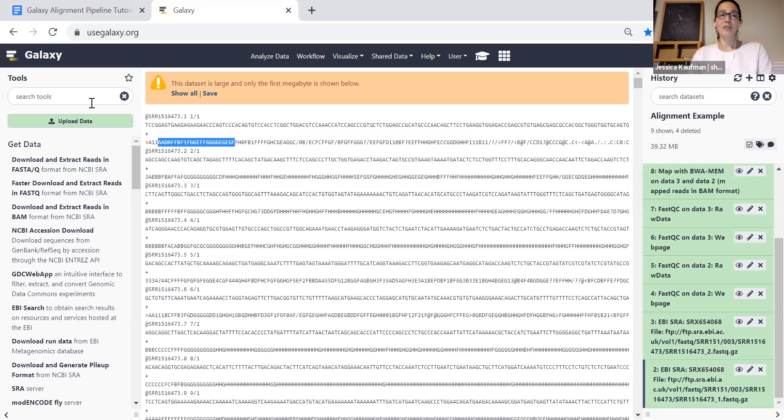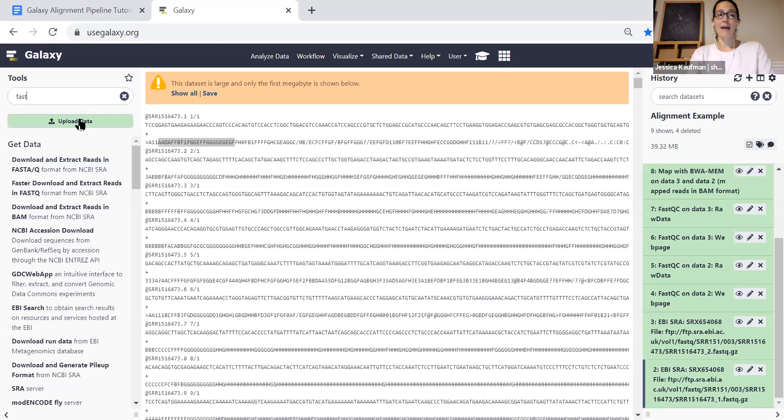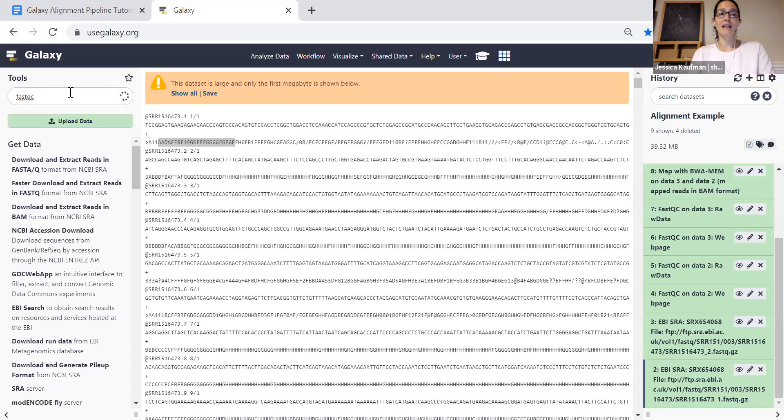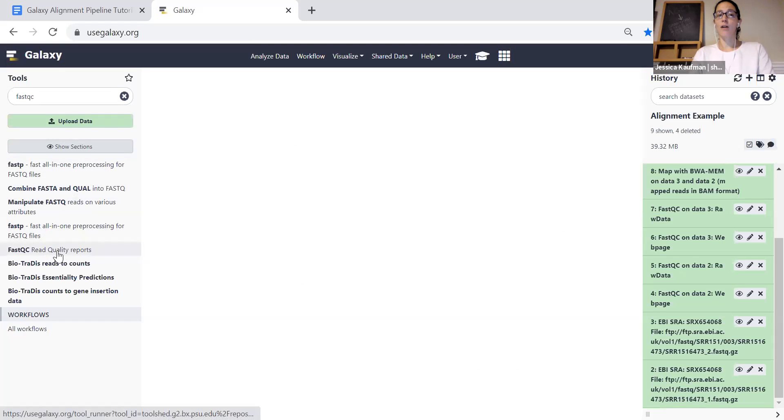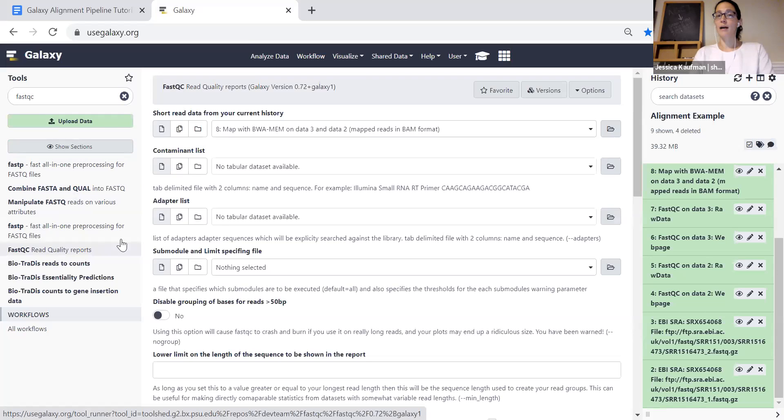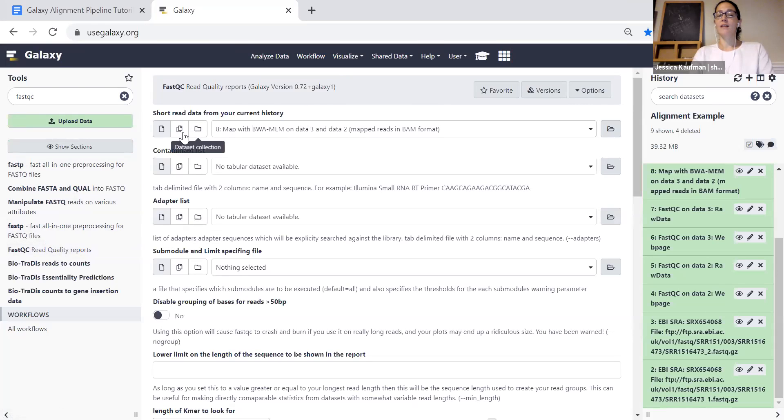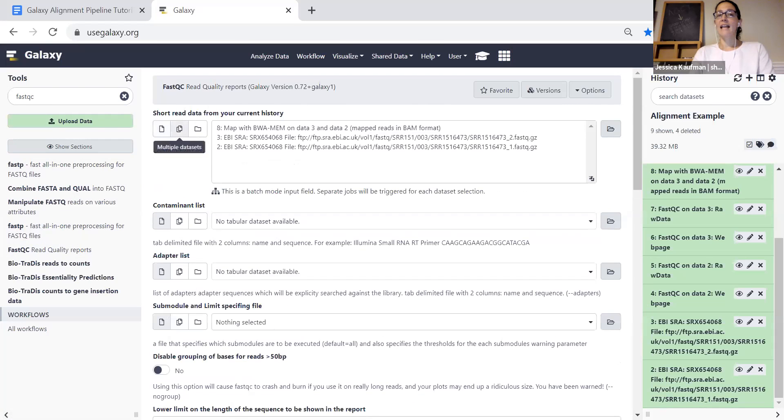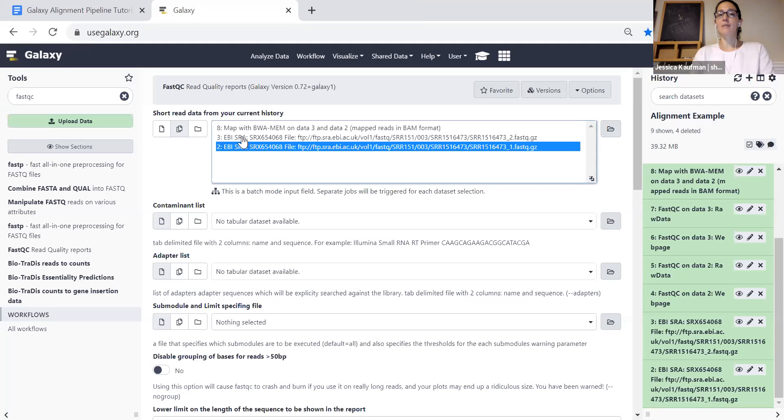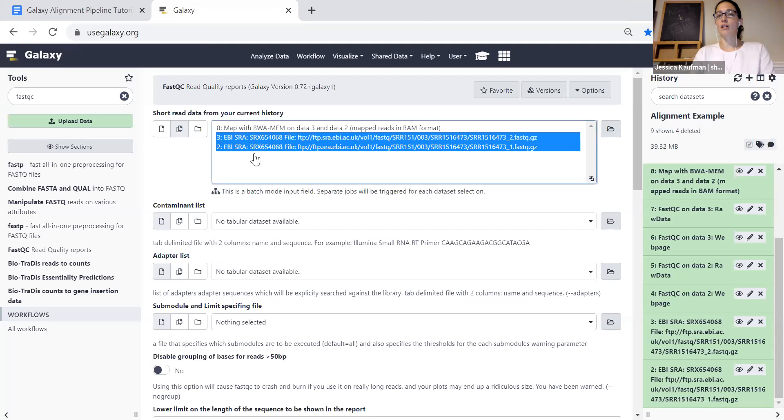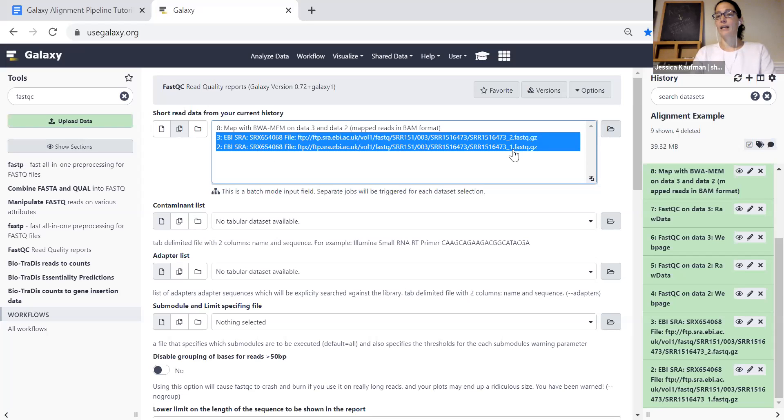We want to figure out before we use this data for an analysis how high quality is it. The way that we can do that is with the fastqc app. So I'm going to type fastqc in the search tool. You can see the fastqc read quality reports come up. Anything in my history is available for the fastqc but I specifically want to look at these fastq files from the EBI SRA, the forward read ends underscore one and the reverse read ends underscore two.